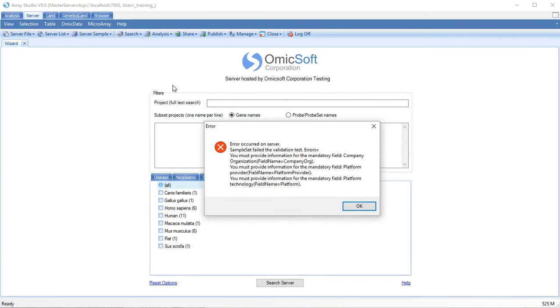If your file is missing a column or sample set metadata, you'll be notified by an error. The sample set I specified was missing 3 fields.